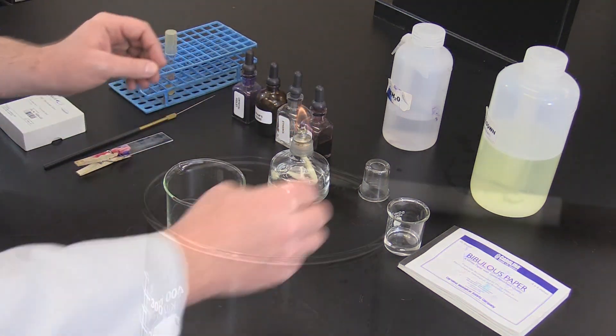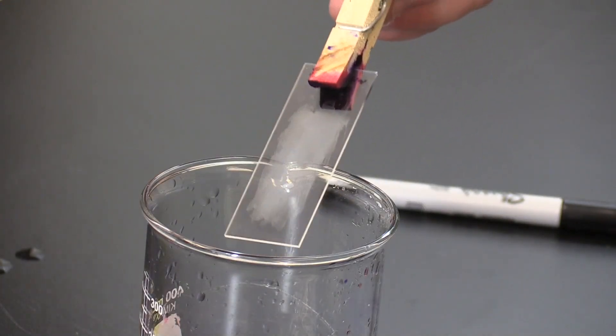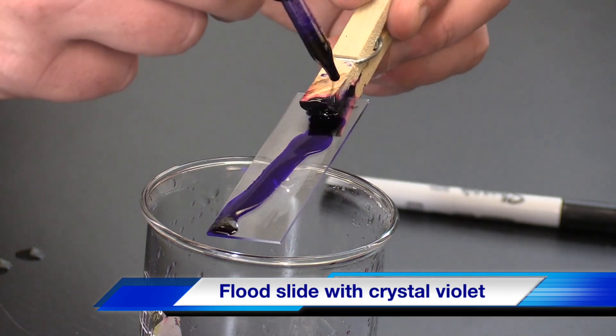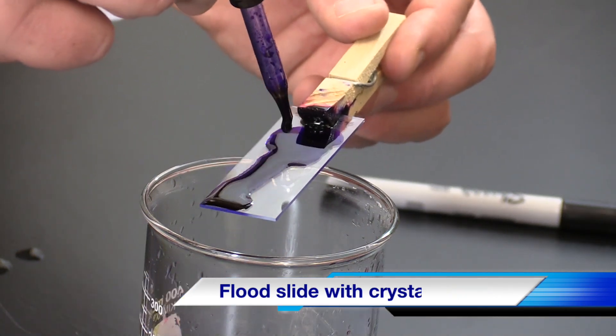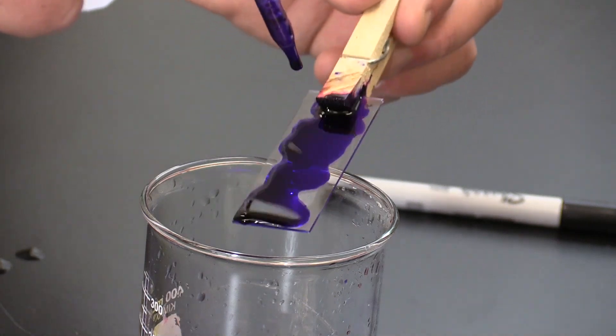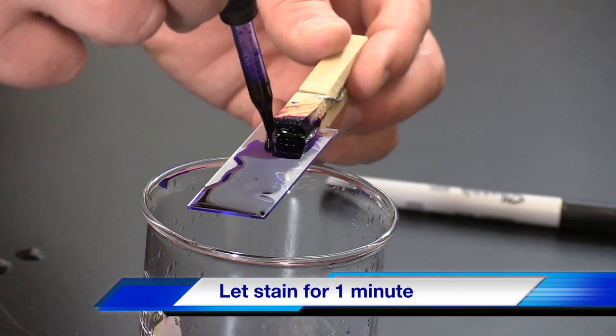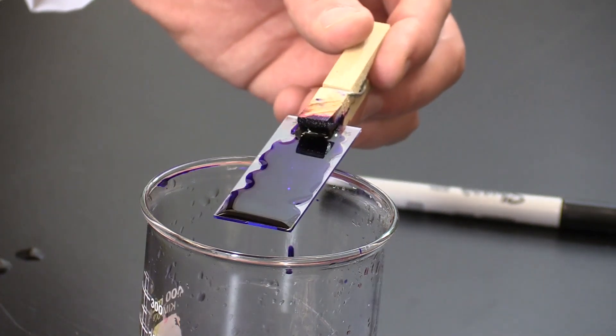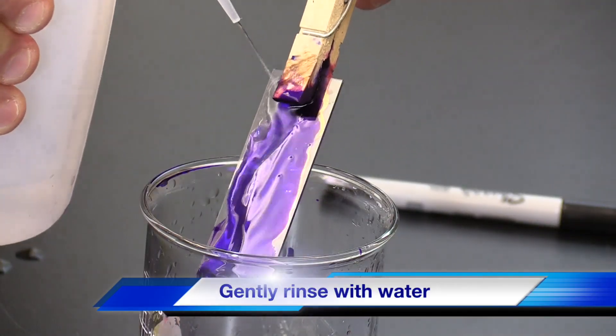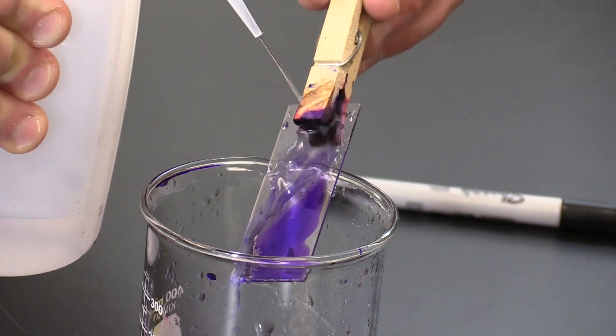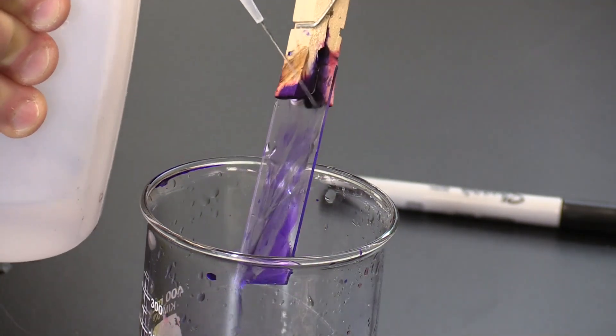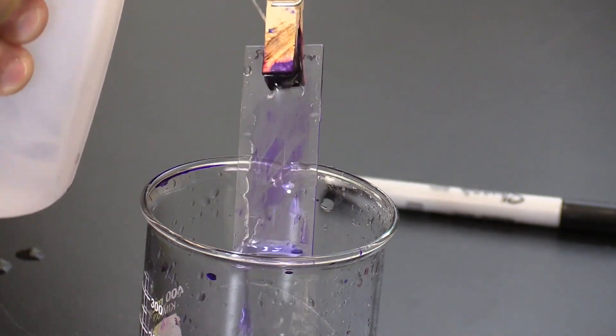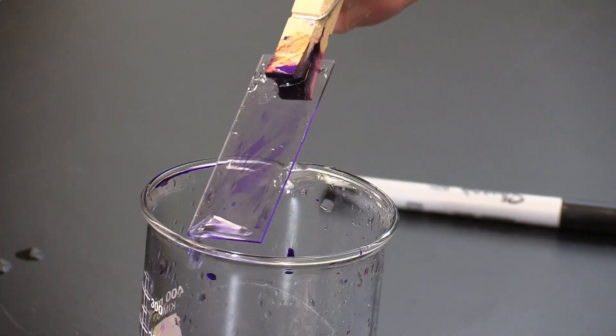Working over a sink or beaker, flood the slide with crystal violet to cover the bacterial smear. Allow to stain for one minute. After one minute, rinse the crystal violet away with water until the water running off the slide is clear. Take care to avoid directly spraying the smear with a jet of water when rinsing, as the bacteria in the smear can be washed off.